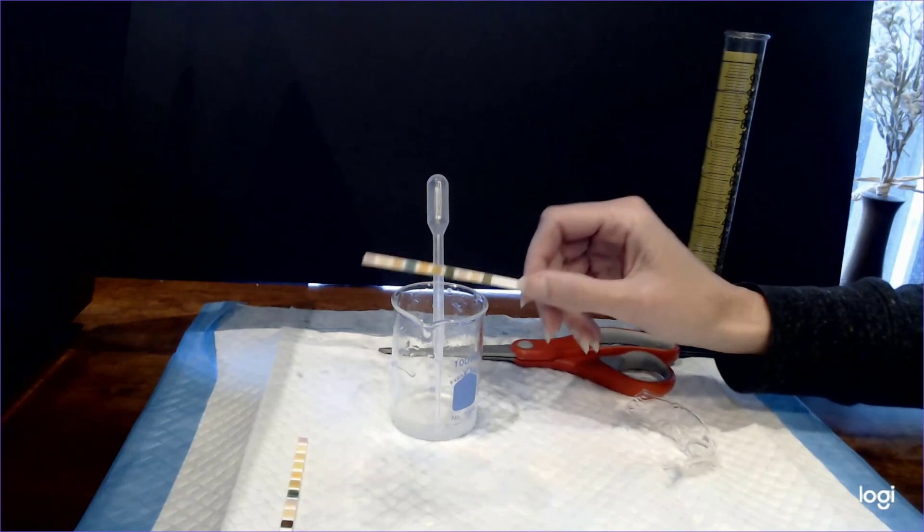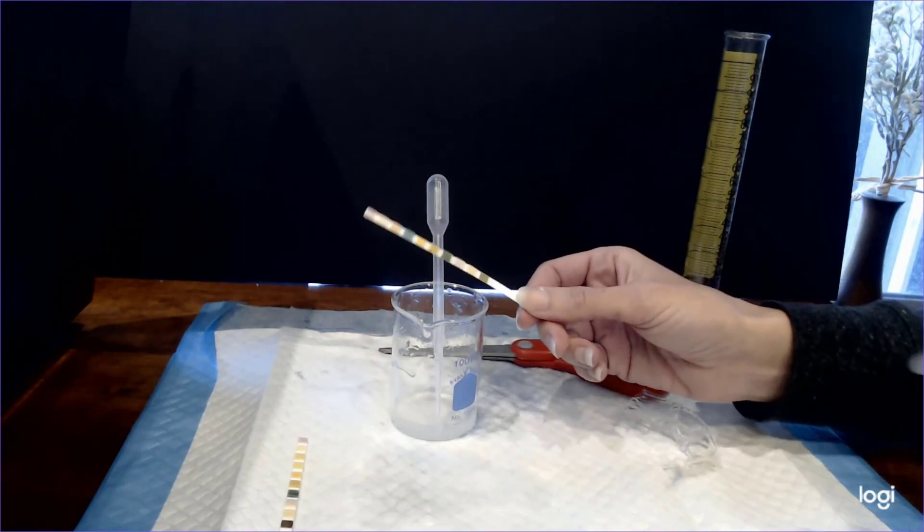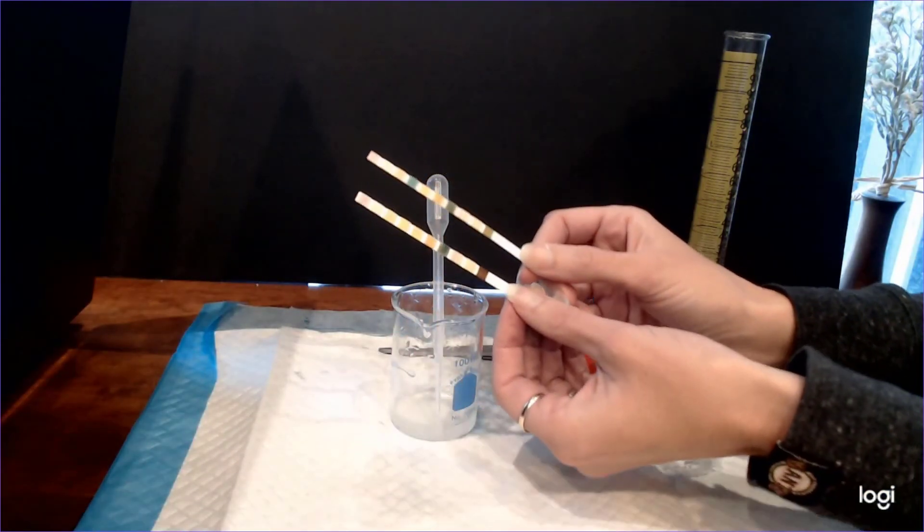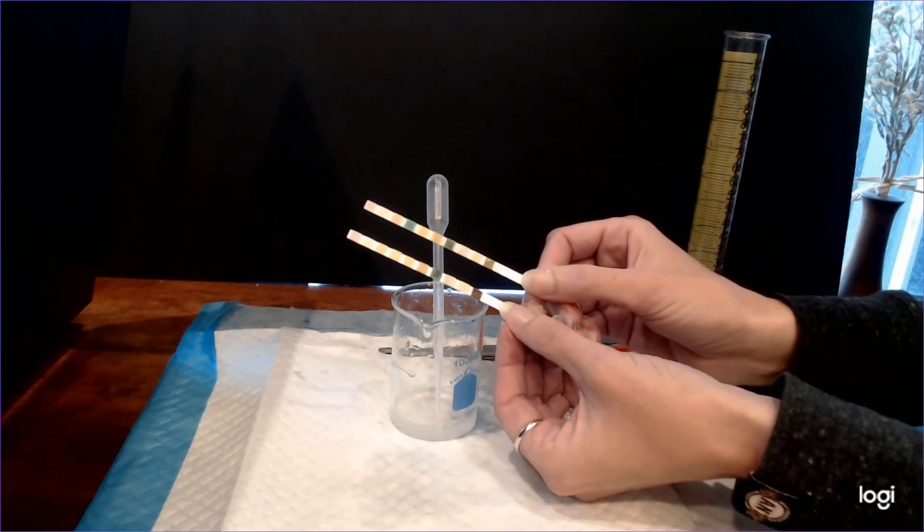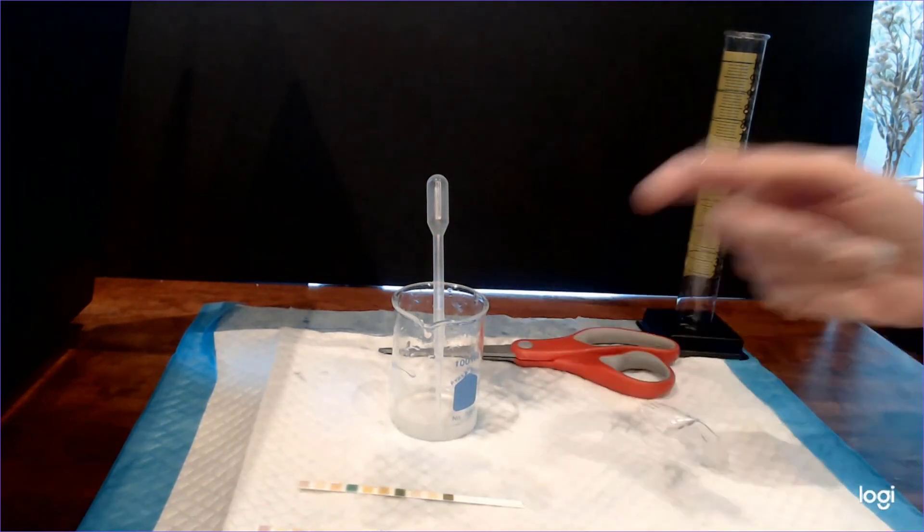So once again, once you do that then go ahead and rewind this video and look again at the key so that you can determine the presence of sugar and protein.